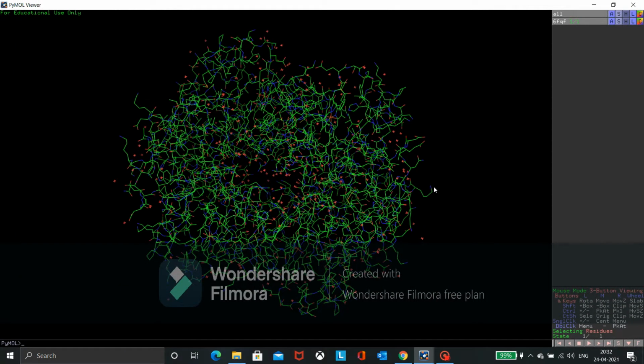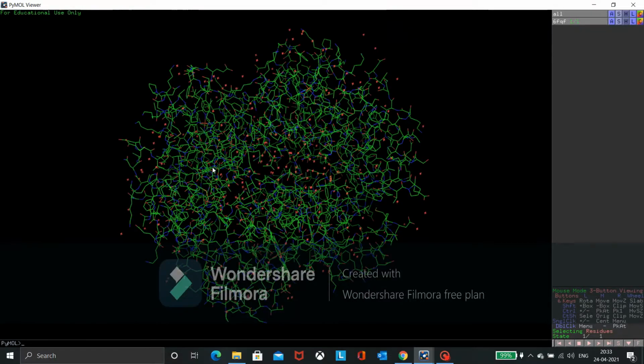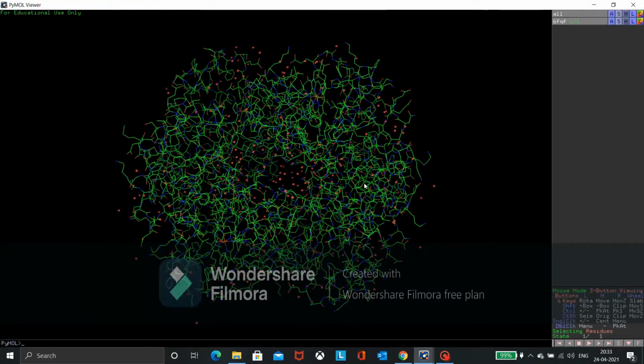Welcome everyone. Today we are learning how to use the Pymol software. Basically, it's an app where we can visualize the chemical structure of a molecule. So the molecule right here is in a PDB file and is the hemoglobin structure. So let's get started.